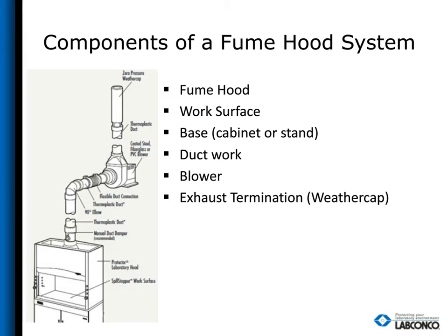Also, if the blower is built-in, meaning it is sitting right on top of the fume hood, the ductwork will be under positive pressure, meaning that blower will be pushing the air up from where the blower is located. And that means if you have a leak in your ductwork, that contaminated air will be pushed out of the duct at that location. So a remote blower is always a fail-safe since the duct run will be under negative pressure the whole time.